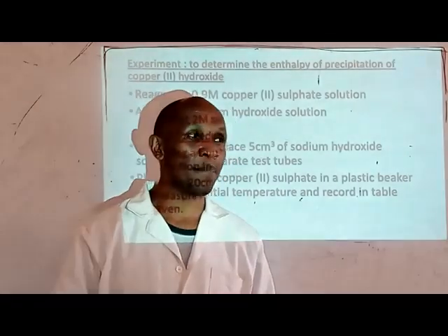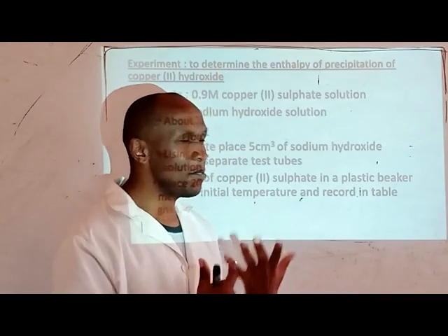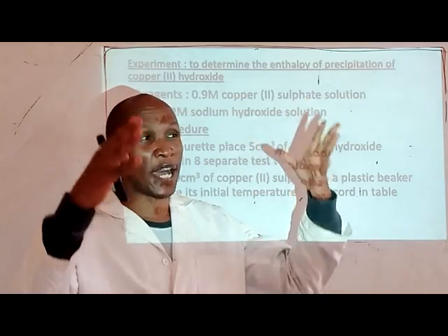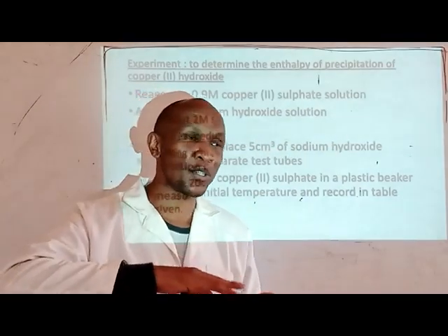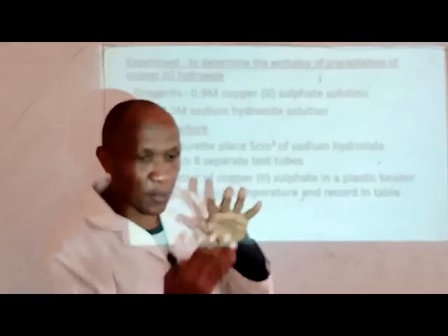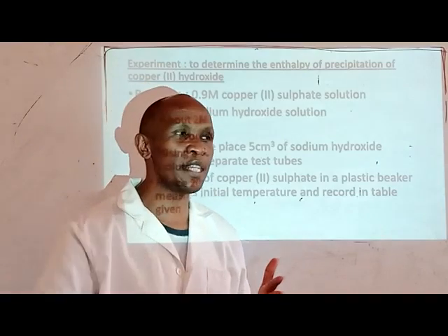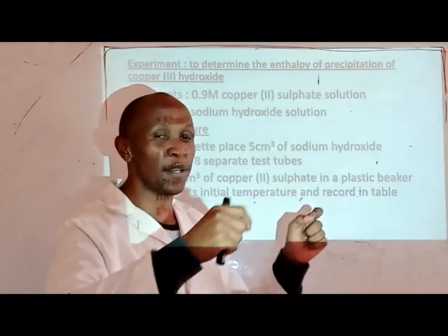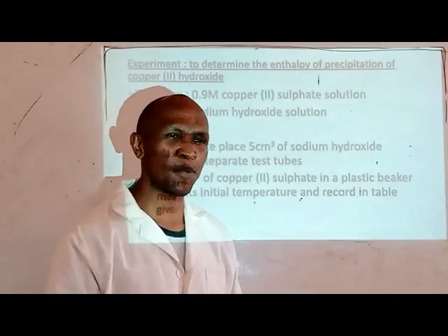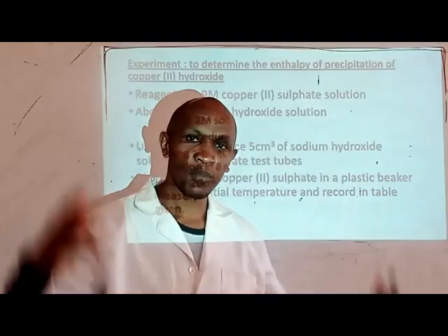I'll note the maximum temperature reached after I've stirred a bit, but make sure that you don't stir forever, because in these reactions the temperature rises, and when it gets to the maximum, it starts cooling towards room temperature. So you should immediately, the word is immediately, once you are through with collecting the data for the first one, get to the second one as fast as possible. Some students have a tendency of stirring forever.